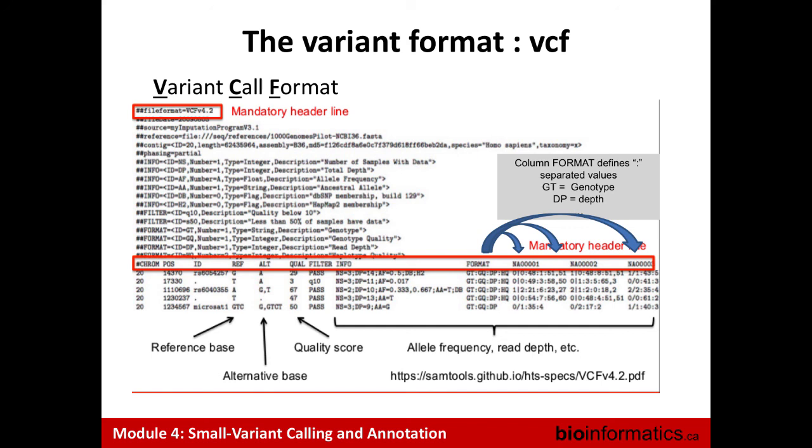As I say, for subsequent analysis you will do, then be cautious and think about what you are doing. But for variant calling, I will definitely include them.